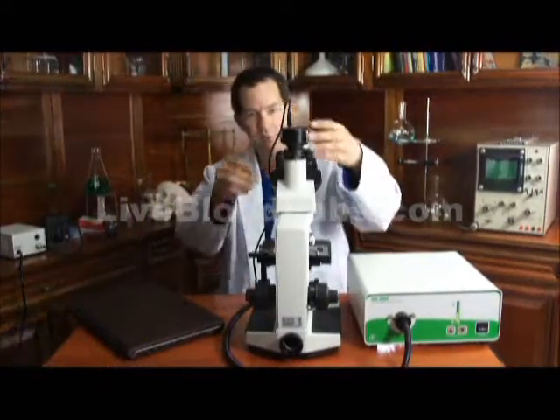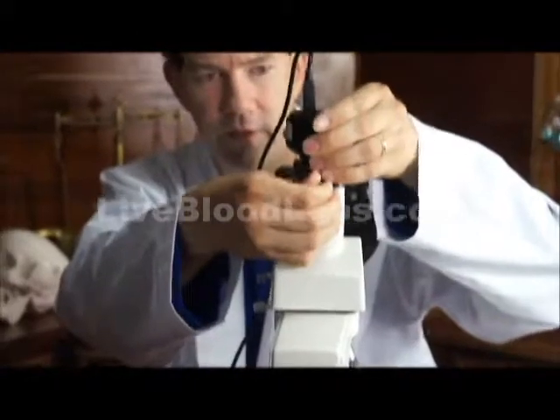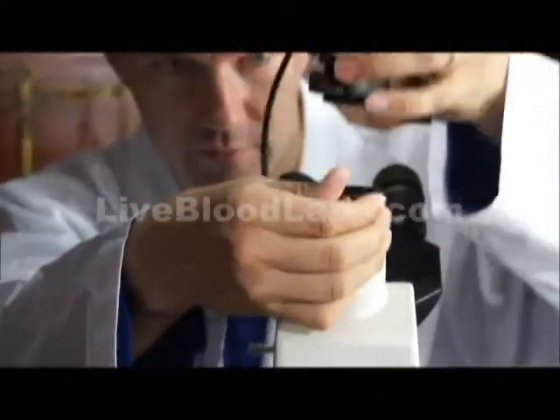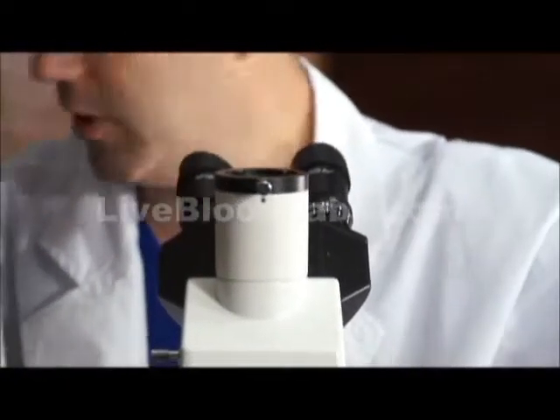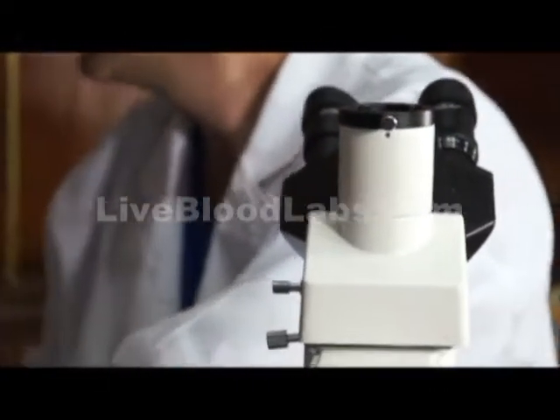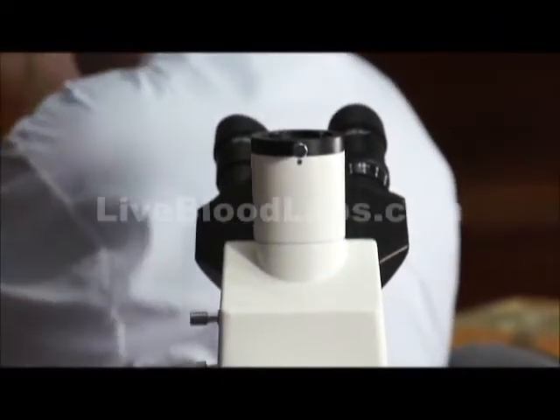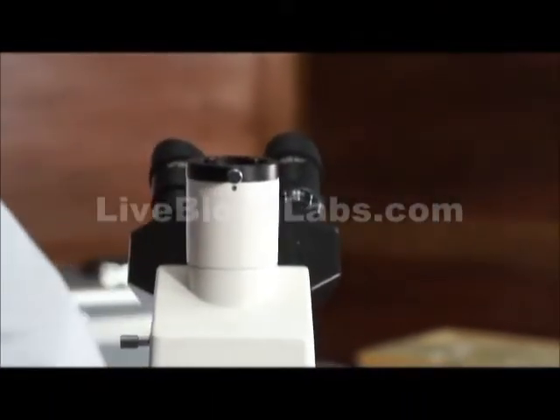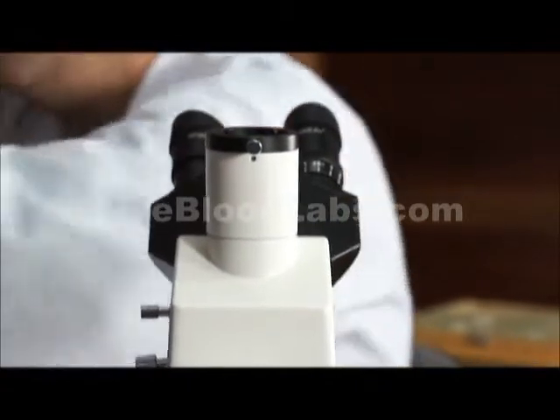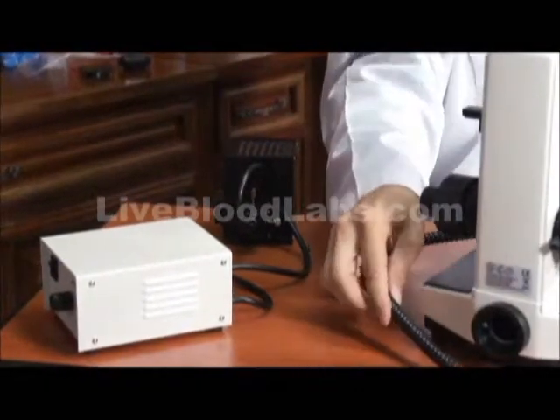Looking at some other features, let's take a look at the bright field functionality. I'll take off the camera and turn off the light — the fiber optic illuminator. This is the power box and the external 50-watt illuminator for the bright field.